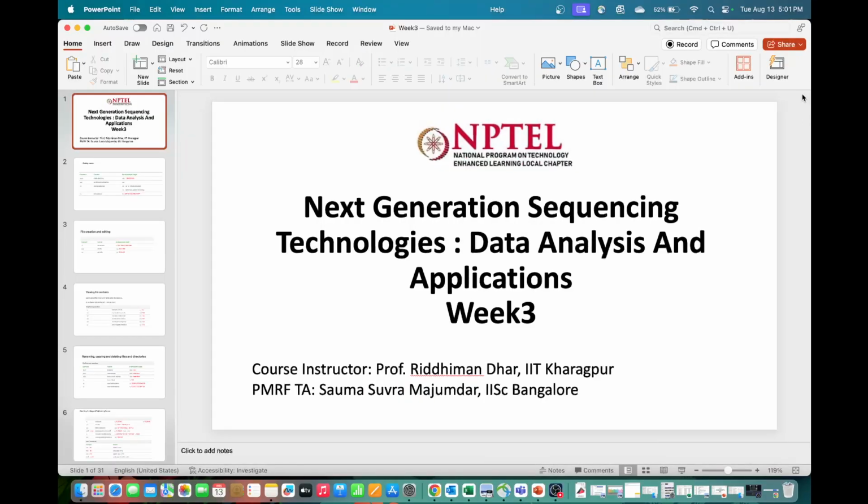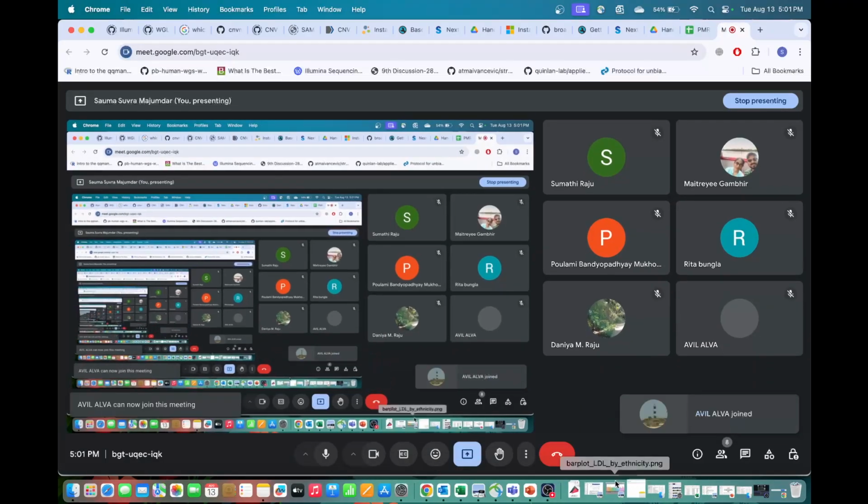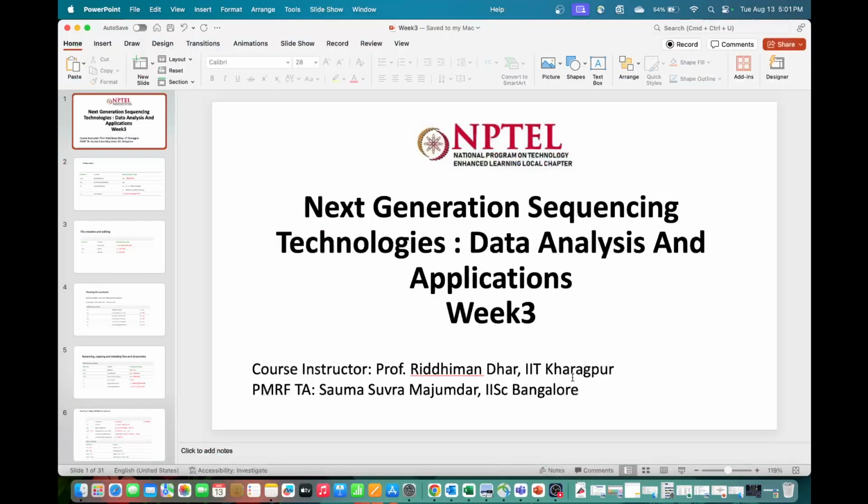Okay. So welcome to week 3 of the live session on NGS data analysis and applications. This week we'll cover Linux commands and what you can do, how you can modify your files, how you can move your files from here to there, and how you can do various things with your data using just Linux commands.